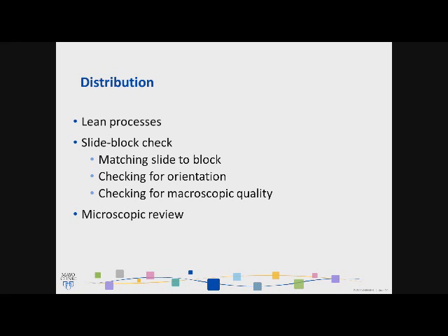Each morning we also review an H&E slide for each of our runs for the H&E stainer, just to verify that the stain run is acceptable. Sometimes it's off, and sometimes slides have actually gone through before they review that slide, and it's frustrating, but as long as we can review those and get those taken care of in time, there is no rework. And again, no histologist knows frustration more than having to recut cases, especially those frustrating cases like bone or breast.